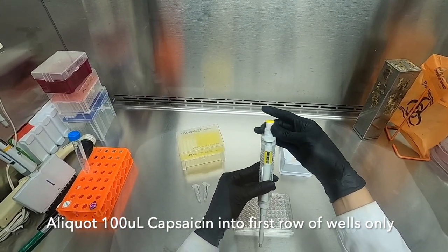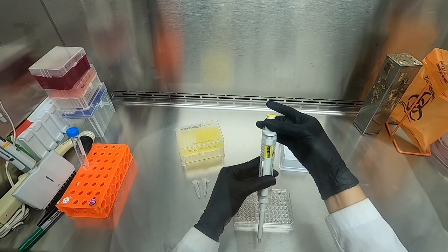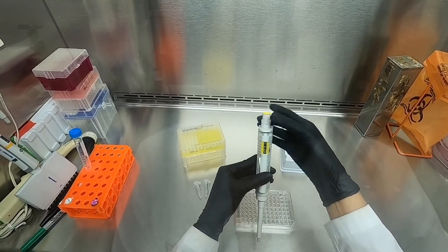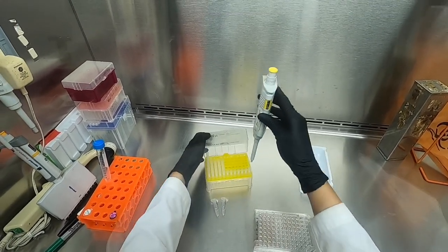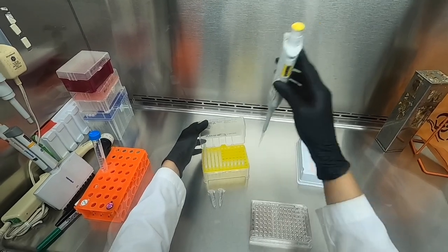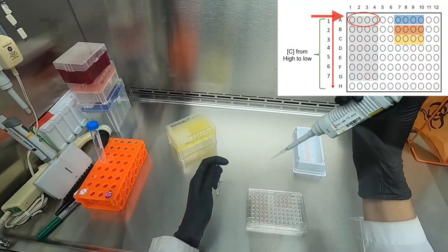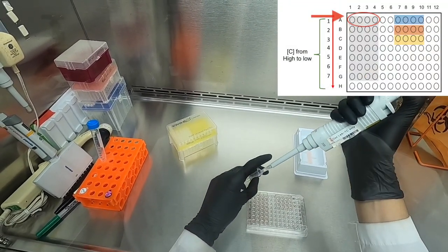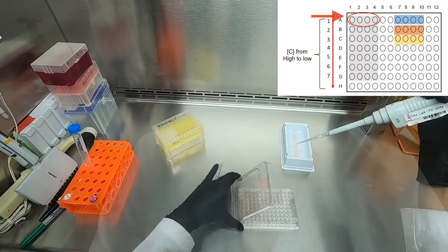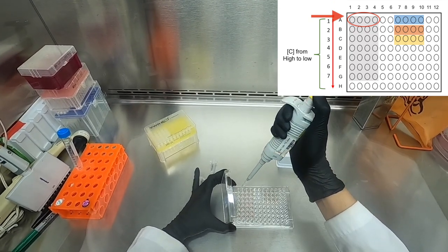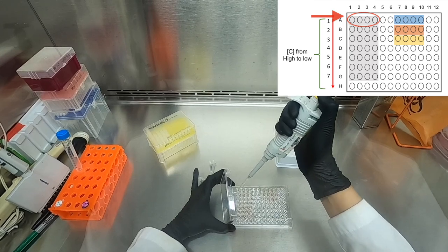If we refer back to the manual, we will see that our stock concentration of capsaicin is at a concentration of 400 micromolar. This means that by dividing it in half in these plates, our highest concentration will begin at 200 micromolar and our lowest concentration will be 3.125.